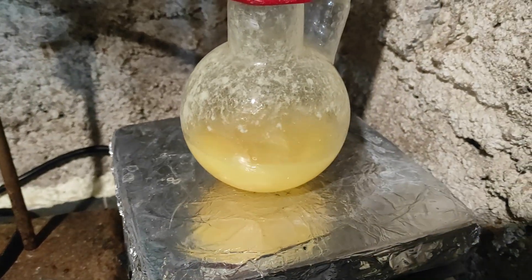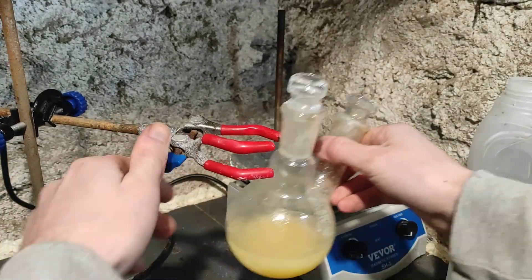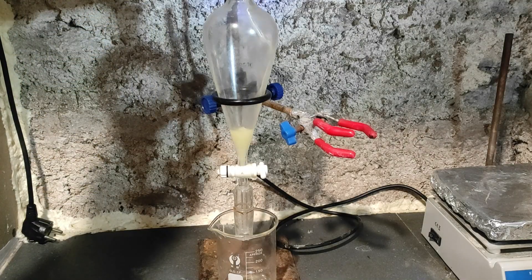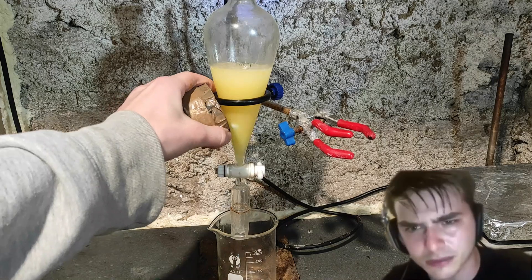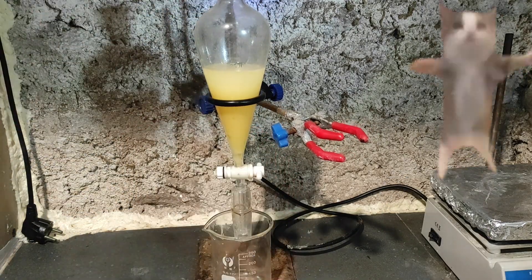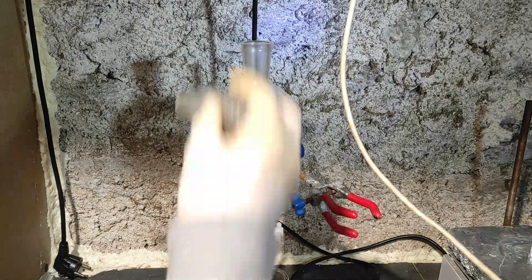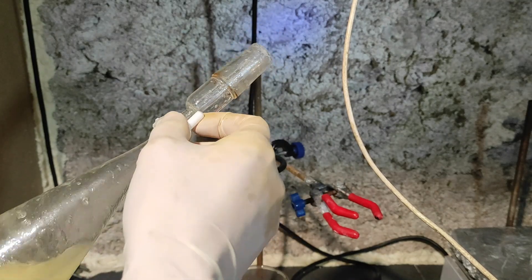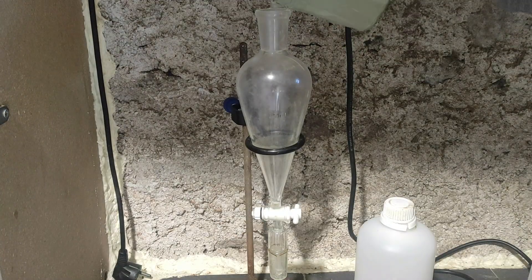When the hydrochloric acid addition is finished, we are left with a cloudy yellow mixture. In theory we should see a water layer and an organic layer, but they don't separate very well, so I added some water to separate them better. I then poured the two layers into the separation funnel. I also added some dichloromethane to again have better phase separation, then shook and vented the funnel a few times. I extracted the organic layer a few times and then put it on the hot plate.